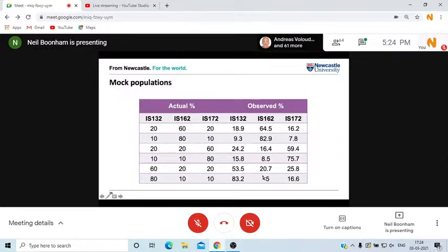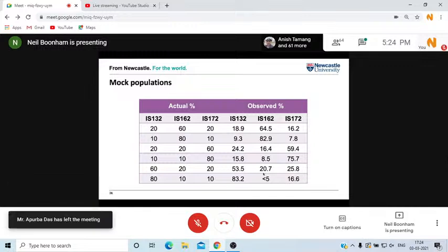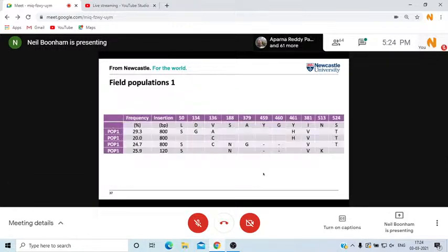Where we get very small proportions, we start to not be able to resolve it. So here, it was less than 10%. We could see it was quite low, but we didn't really know exactly what the percentage was. So we think our cutoff here within populations is isolates that are present within the population at greater than 5% is approximately where our precision lies. And so we started to look at some populations.